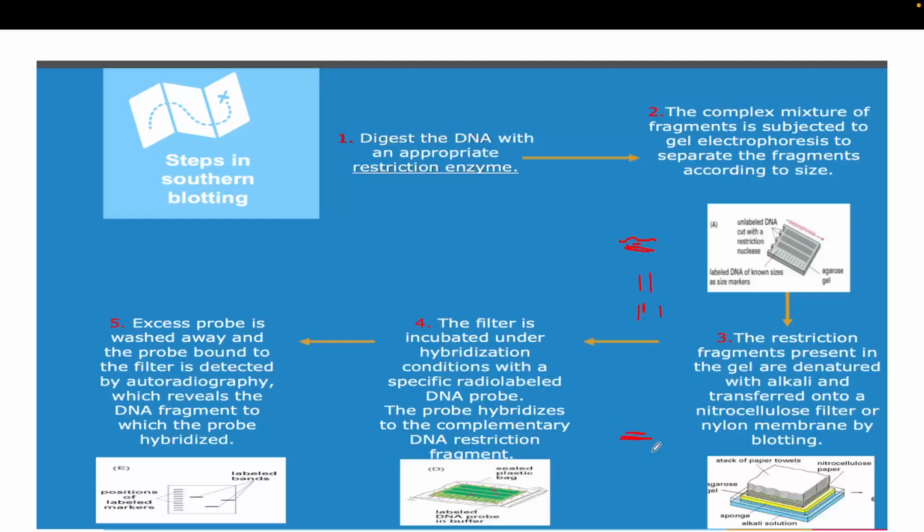In the case of Southern blotting, capillary action happens. So there will be uniformity in the capillary action. If there is any air gap, then the capillary action will not be very good, and it can hamper your transfer process. So we have to look carefully when we are doing this type of blotting technique. This is how we organize the Southern blot apparatus.